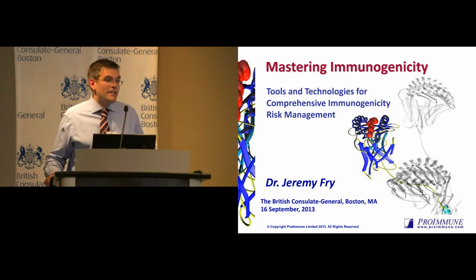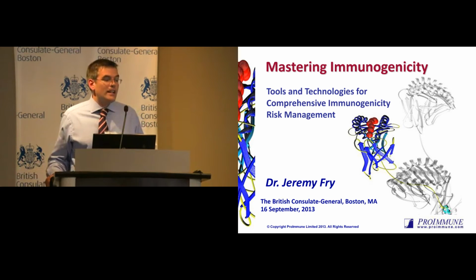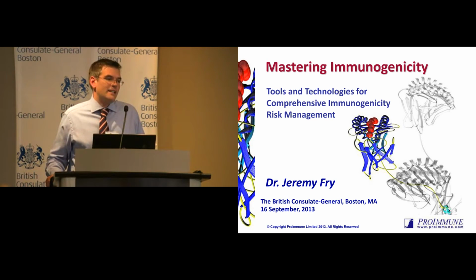With the antigen presentation assay, all you can do is see peptides that are there. You're not able to see peptides that aren't. And obviously any assay is going to have a limit of detection anyway. With regards to the overlapping strategy, you're generating synthetic overlapping peptides. That's one approach, so I don't think you can eliminate that. What this does allow you to do is identify some peptides that are naturally processed. But if something is not there, or is there in a way that we're not expecting, then you're not going to see it in that assay.